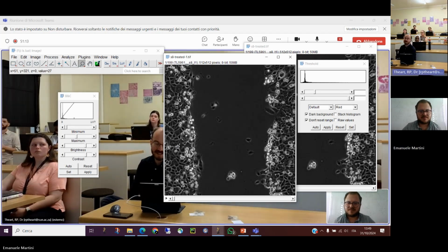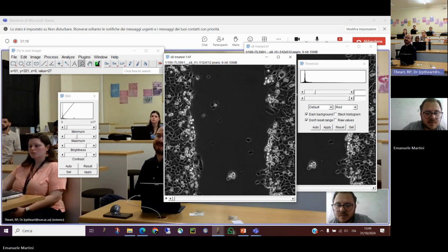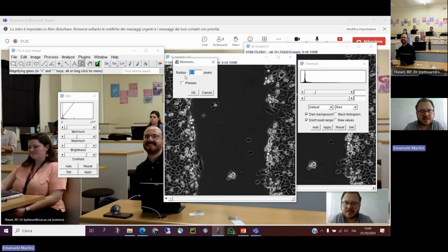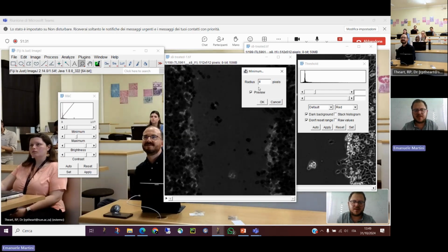So someone suggests a minimum filter. Maybe it works. Never tried. Let's see if it can be an idea. I think it's not a good one because you will create more disasters. What are you doing with the minimum filter?